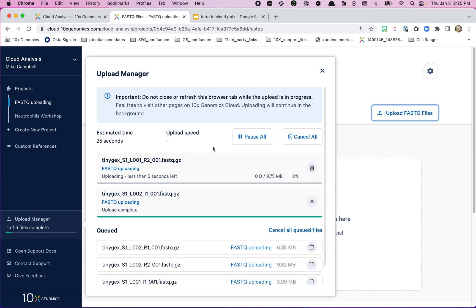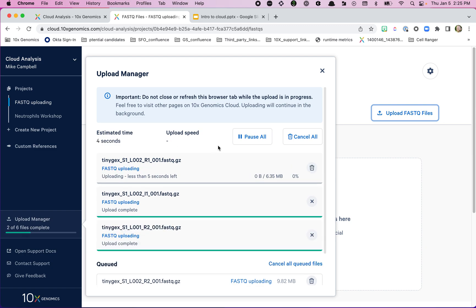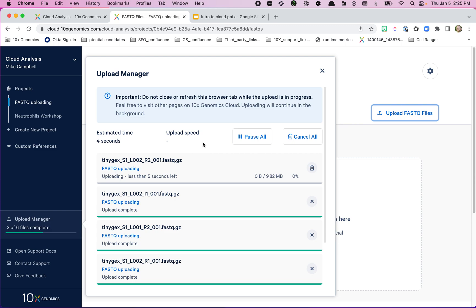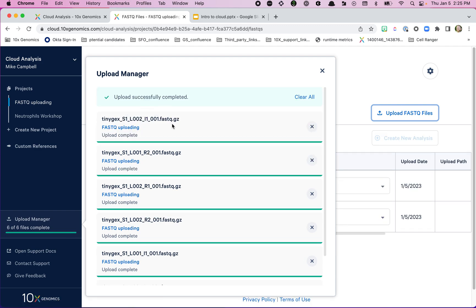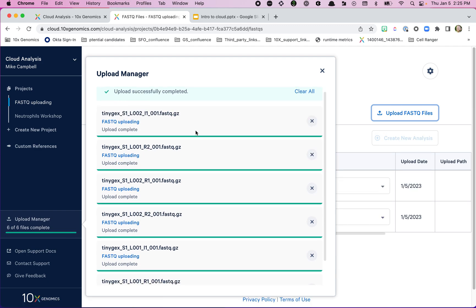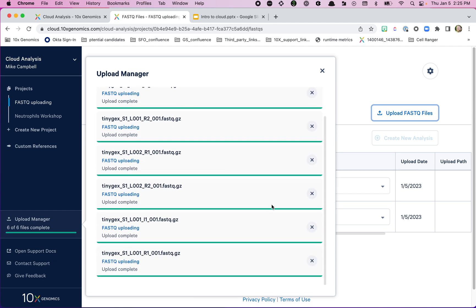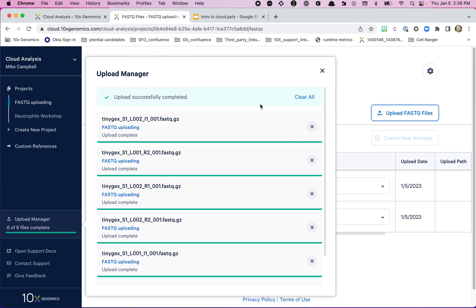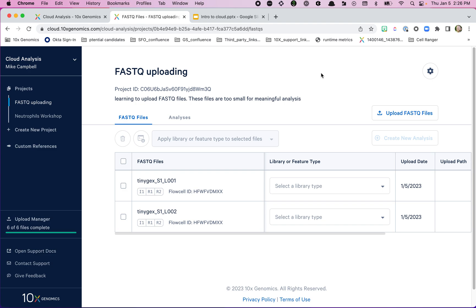These files are pretty small — I did that on purpose so this wouldn't take forever. The upload manager gives you a way to track what's going on: what's being uploaded, how long it's taking, and the expected time remaining. Now everything says it's uploaded — we've got a little green 'Upload Successfully Completed' message — and we'll close out of here.